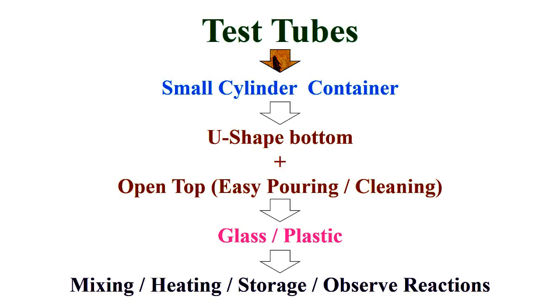Test tubes are small cylinder containers, with a U-shaped bottom and open top, for easy pouring and cleaning, made of glass and plastic, used for mixing, heating, storage, and observing reactions, as mentioned in the next slide.